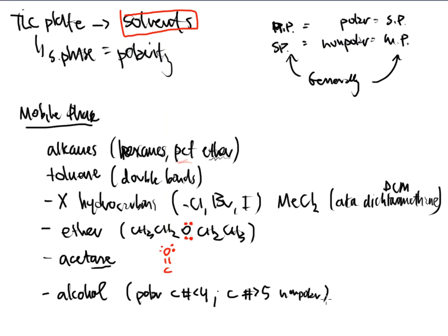And then finally, down here at the very bottom, if you really want to do a super polar acid and you want to increase the polarity here, you would use something like acetic acid. Some of these are basically C double bond O, OH molecules. Carboxylic acids would also work. Those are very polar. We see some delocalization that can be present. We see some free pairs of electrons that can be here on this oxygen. It can also be here on this oxygen. Those things can float around in the entire molecule. So we increase our polarity because of that.